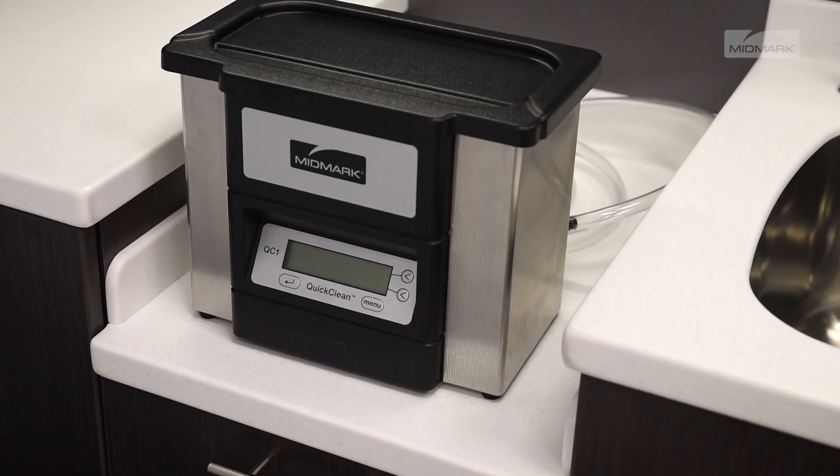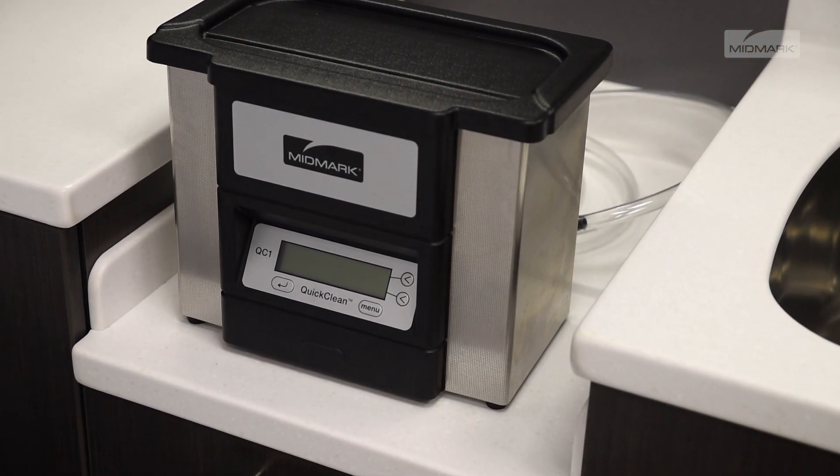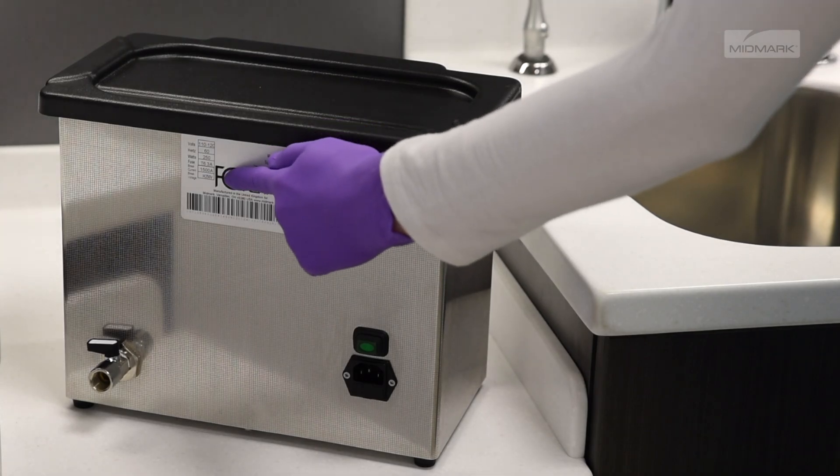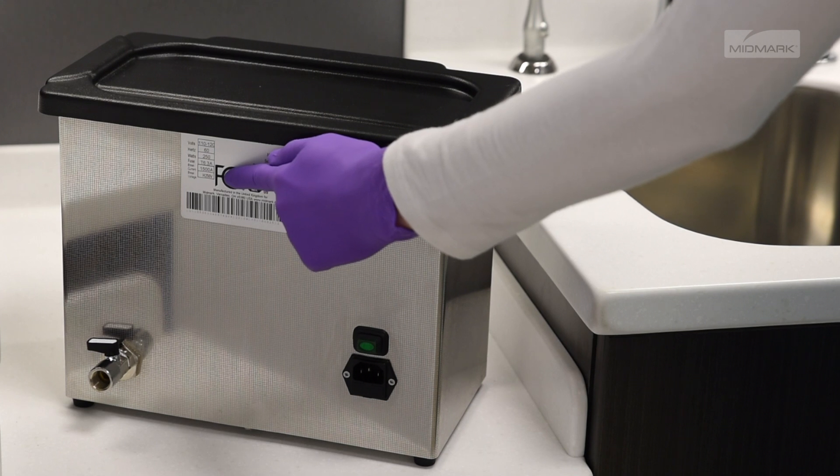Position your tabletop ultrasonic on a water-resistant table or countertop within reach of a standard grounded electrical outlet and sink. The label on the back of the cleaner will identify proper power requirements.